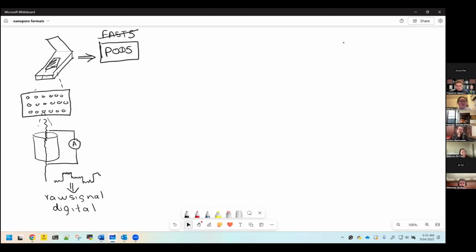So today, therefore, we are going to talk more about the format called SLOW5, which we developed a while ago. One of the reasons, which is applicable at the moment, is that it's a very simple file format. We try to keep it as simple as possible while keeping the performance and storage also minimum.